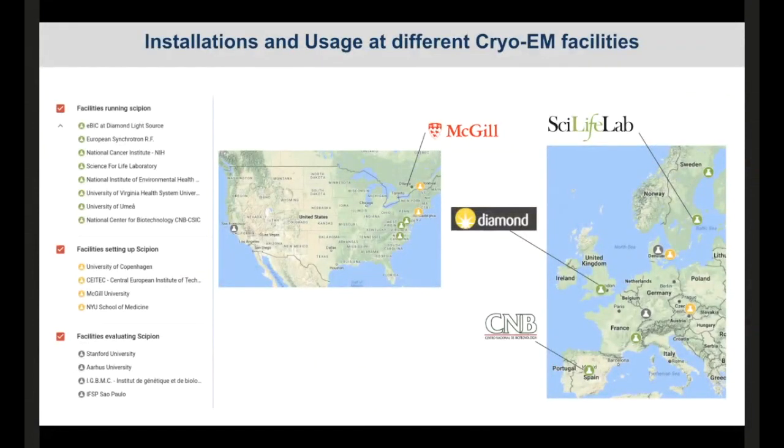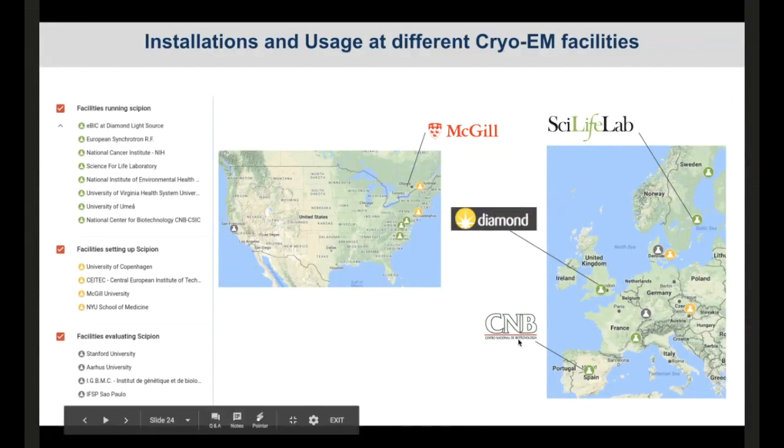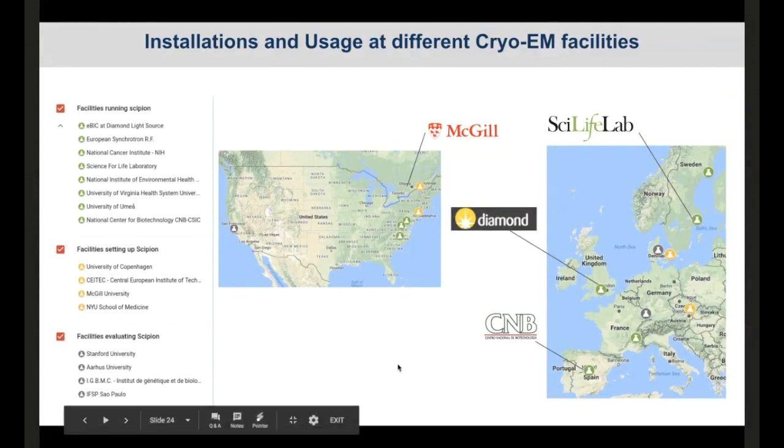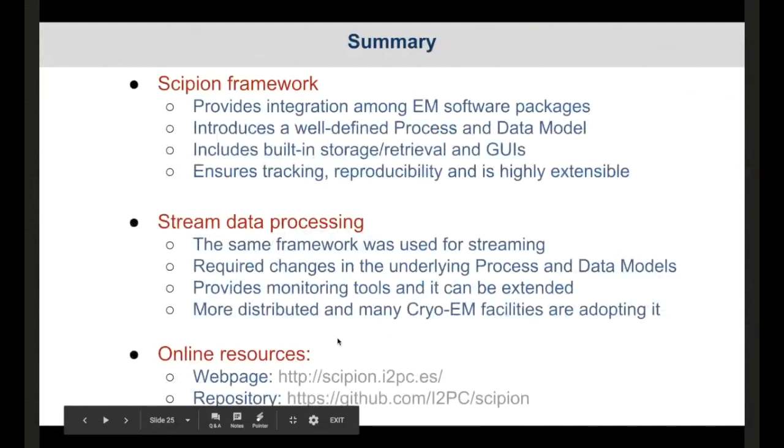Also, it has been quite adopted in many facilities, of course, mainly in Europe, but it's also now becoming more interesting in the US and Canada as well. Here in Europe, there have been three points where we have driven the development of these streaming capabilities. One was in Madrid, of course, also here in Sweden, and then in Diamond. So we have a really productive collaboration, and now it's been adopted in many other places in Europe.